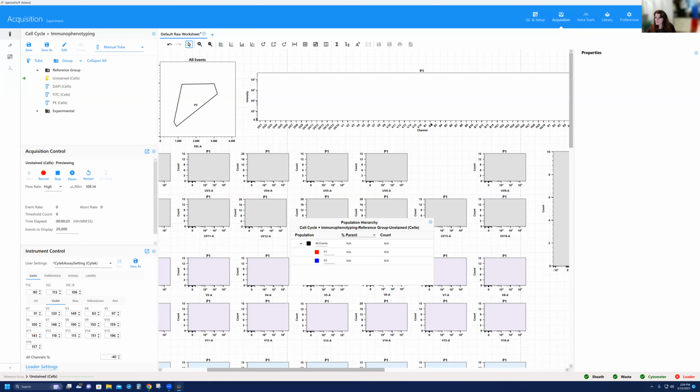So luckily for us, the way we've designed this panel for having UV and violet is the main laser line for DAPI, and our FITC and PE is most notably seen in our blue and yellow-green laser lines. Through that, we've designed this panel so that we'd only have to bring down the UV a specific amount or the violet a certain amount.